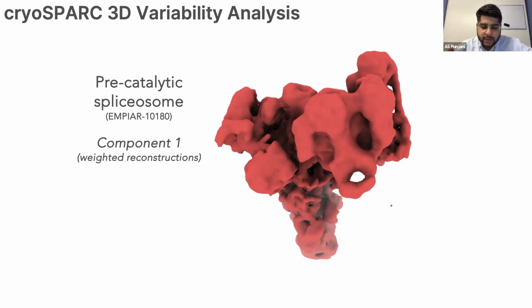In fact, you should just run them in parallel if you have the GPUs, do like 10 angstroms, 5 angstroms, 3 angstroms, depending on what resolution you got to in your consensus refinement. It doesn't really make sense to do a 3 angstrom 3D variability when you're at 8 angstroms in your overall refinement. So the 3D variability low pass resolution should be set to a lower resolution than what you've refined to, but otherwise you should try different levels for sure.